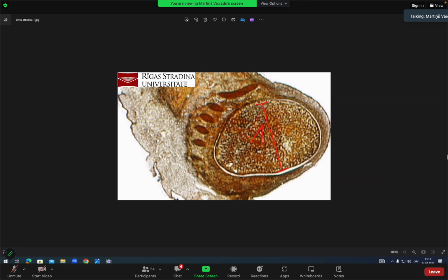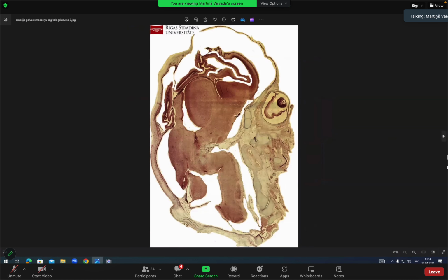And we also see some ribs. I will put the letter R. These are the ribs, most likely due to the section. There's connective tissue, mesenchyme, technically skin also here, but you cannot distinguish any cells at all. So this is a slide of not that great quality. These kinds of slides typically won't appear in the colloquium. So that's one variation that also appears in e-studies. This is not for the colloquium. So it's just a variation of the liver slide. We cannot distinguish the cells at all due to the staining of the slide. And then what else? We will check the next slide.